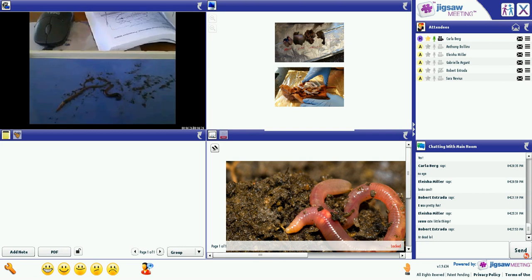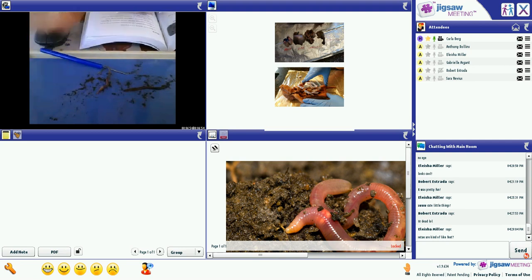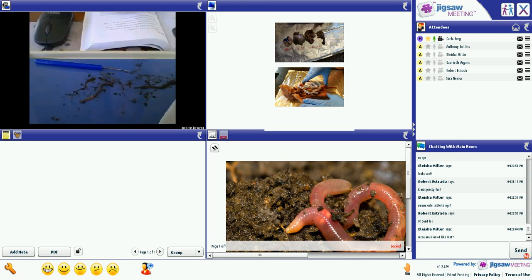Now we need to find the setae. The setae are very hard to see unless you have a microscope, and even then they can be very difficult. I will try to hold my magnifying glass so you can maybe see them. The setae, let me grab one of these guys, are little bristles. Yeah, my worms are too small to see this, but they're little bristles along the side of the worm. So you can label that on page 114.